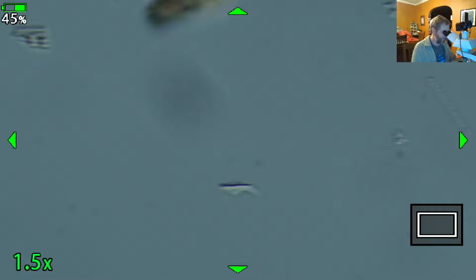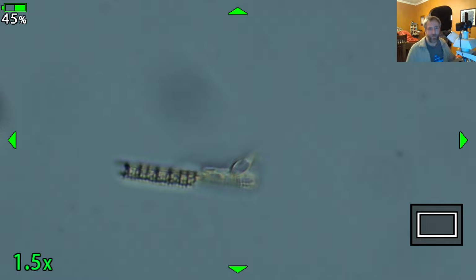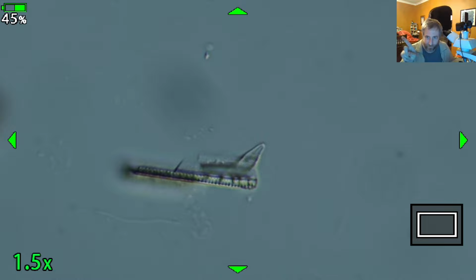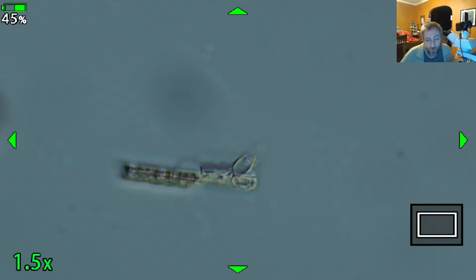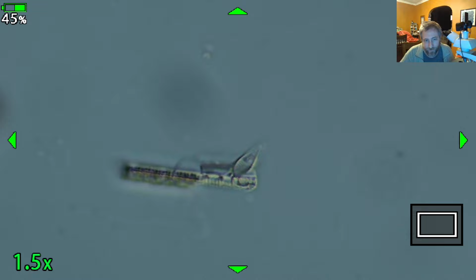I gave you a range in sizes for diatoms. We've seen one in here that was 100 microns earlier, and then here's this little tiny diatom down here. It's actually this little thing right here that looks like a little pointy tail coming off of this other diatom. So the one that's on the side here is a fragment of Grunowia, and then there's this little tiny thing sticking up off of one end of the diatom, and that's actually a teeny tiny diatom. It's maybe 10 microns long. So we saw one that was 100 microns earlier, pretty easily broke 100 microns. This one is 10 or less, and I can't actually tell what the genus is because it's on its edge.